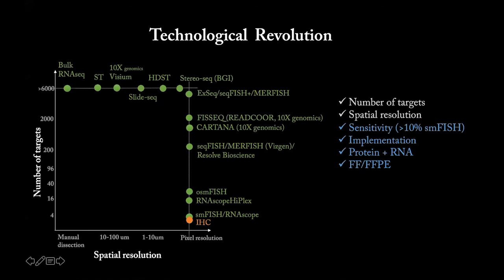And some technology, although at the moment they don't have a very high throughput capability due to some feasibility reasons, actually provide much higher sensitivity. For example, like 40 to 60% of the smFISH, and that will be very interesting for biological application.